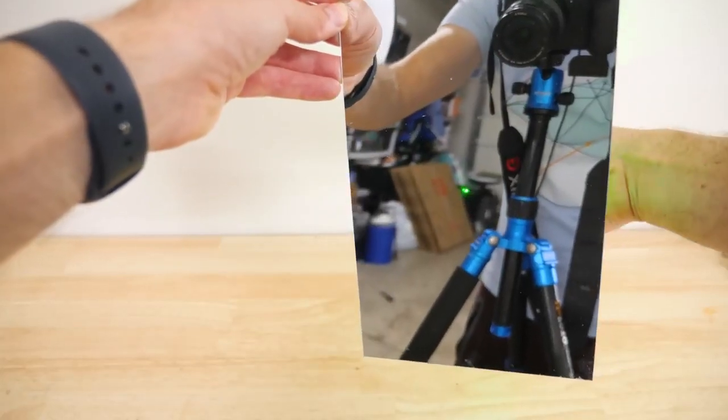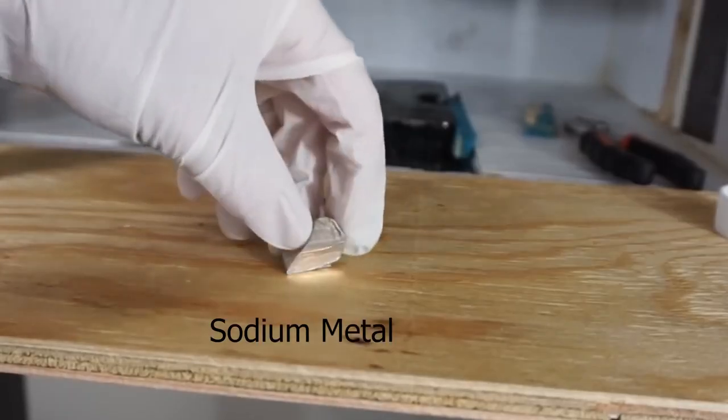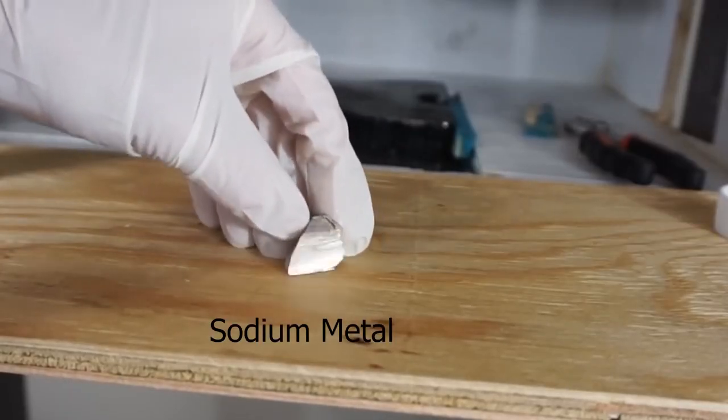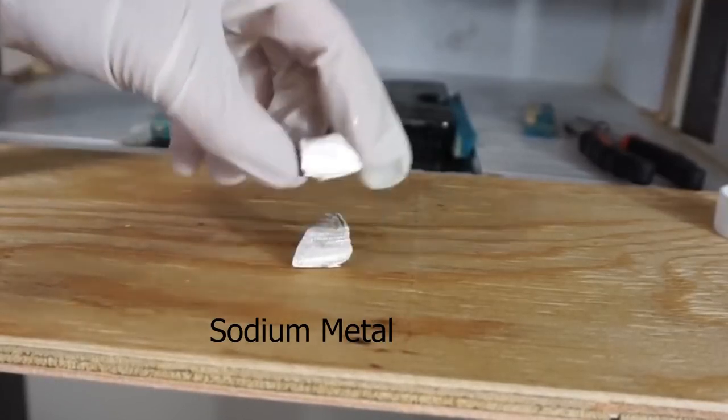Hey everyone, today I'm going to be showing you transparent metal. I've done a lot of experiments with sodium in the past, but we've usually focused on it exploding when you put it in water. But today I want to show you what happens when it doesn't explode. It actually turns completely transparent.